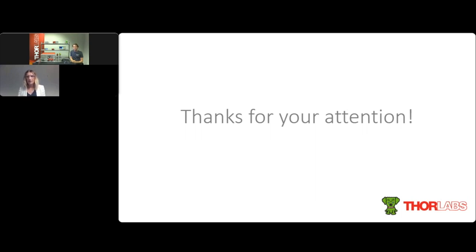You mentioned a special process for measuring pulse sources. What did you mean by that? Right, good question. So the pulsed sources, since the Michelson interferometer needs a bit of time to measure as the retroreflector moves along the stage, this time can be from half a second up to maybe a minute. And since a pulsed source is changing and turning on and off during that time, you can get what we call spectral ghosts. They appear as peaks in the spectrum, but they're not real peaks. They're just phenomena that occur due to sampling.